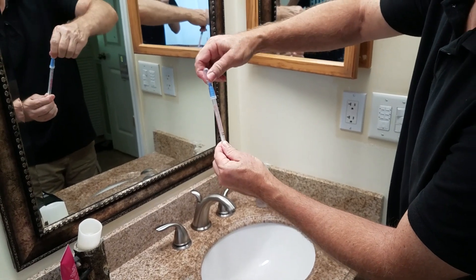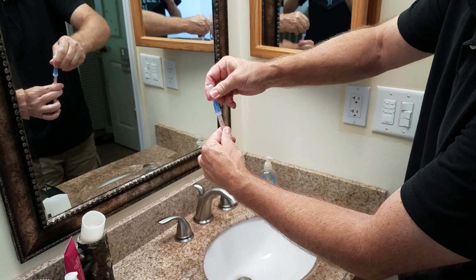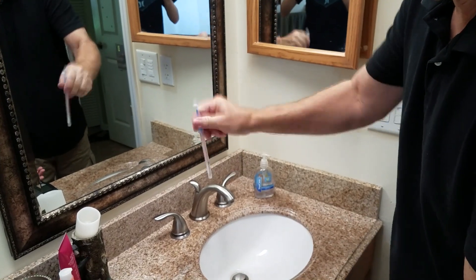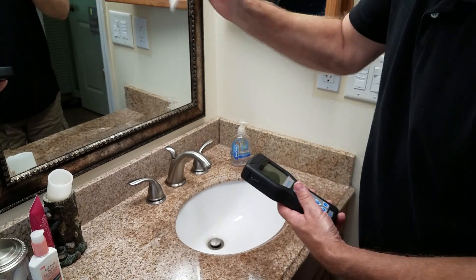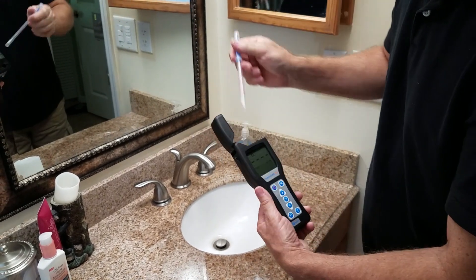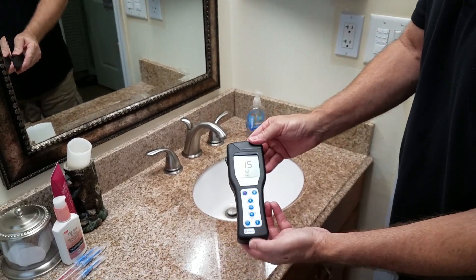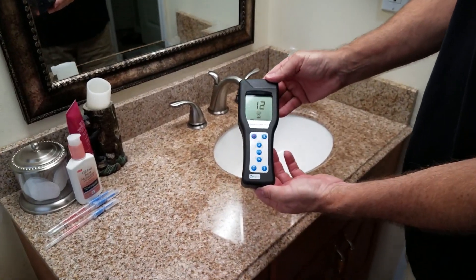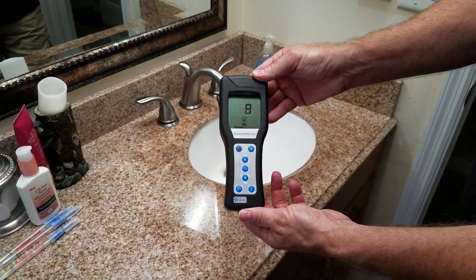I'm going to squeeze the reagent down into it. On this meter, about 30 is going to be a clean surface — 30 or below.